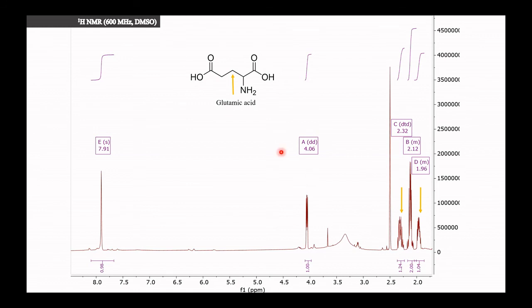And this is the advantage of NMR if you compare it with mass spectrometry. With mass spectrometry, you cannot differentiate between the stereochemistry. But in proton NMR, this is the only way to differentiate, in addition, of course, to X-ray diffraction analysis, but X-ray is only for solid compound and it has to be crystalline.